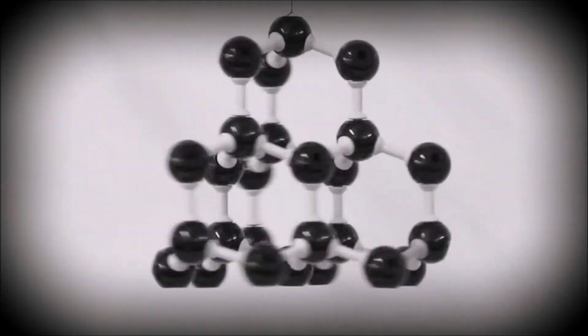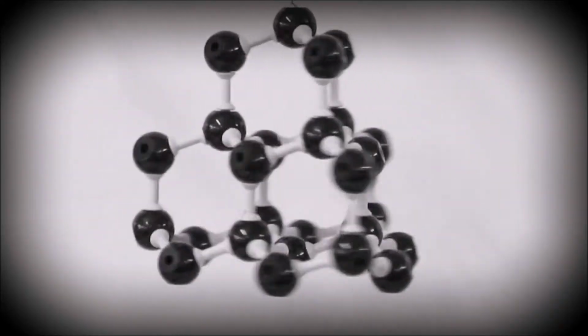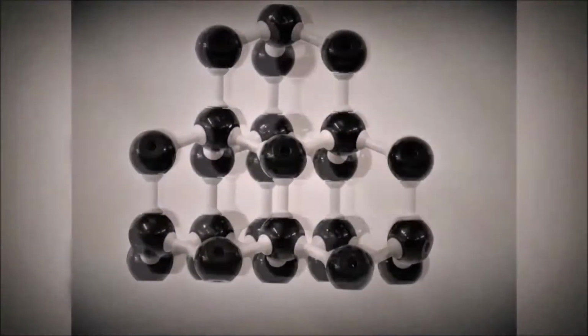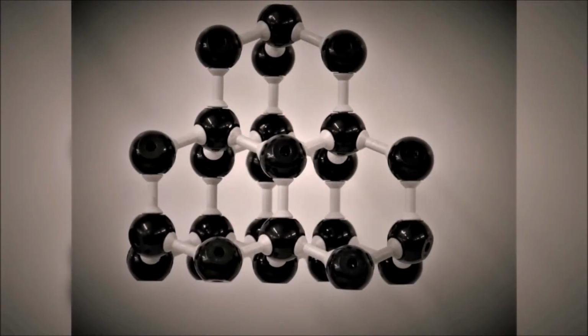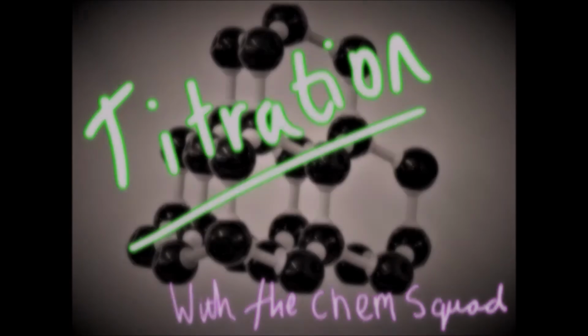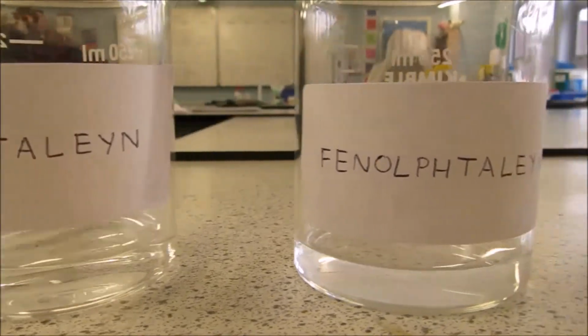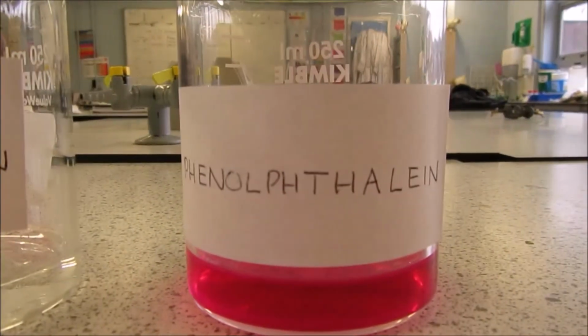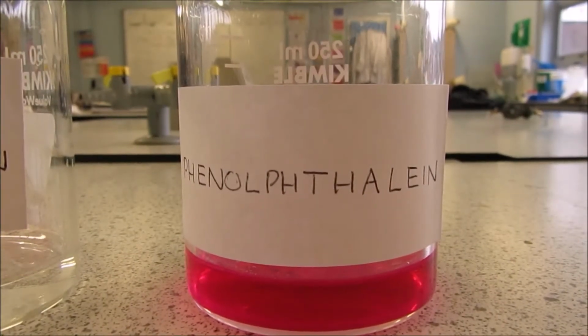Knowing concentrations of solutions is extremely useful information. But how is this determined? And how can we determine this in the lab? For today's experiment, we will be using phenolphthalein. Now write that down. You may need several attempts.